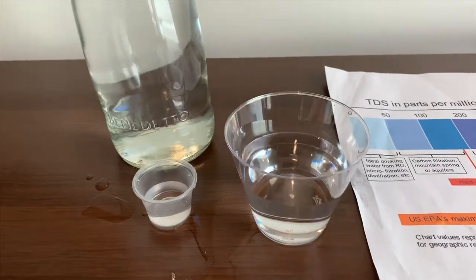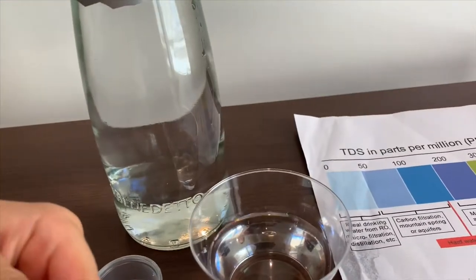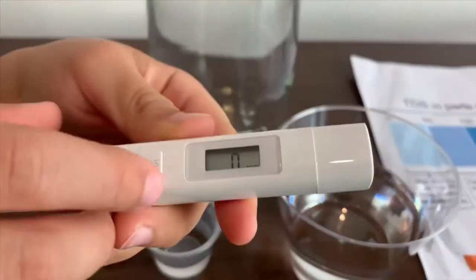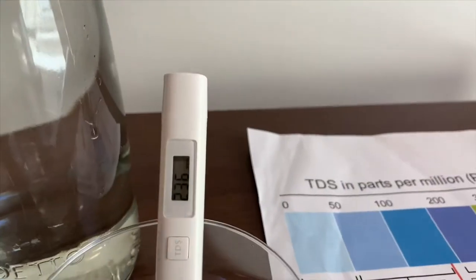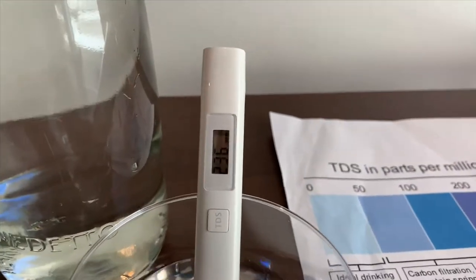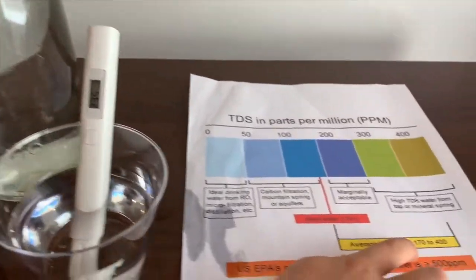First we're going to test the TDS level. Let's turn on the TDS tester. Make sure it says 0. Let's put it in. 236 — that is average tap water.